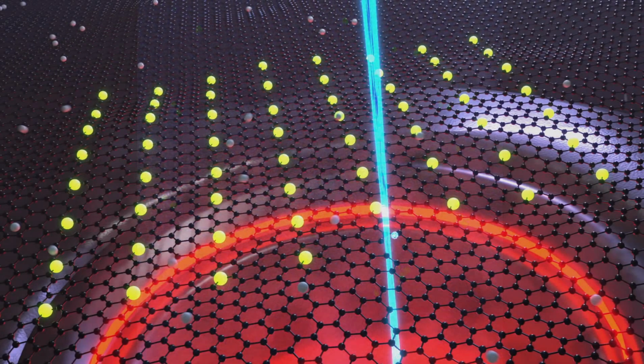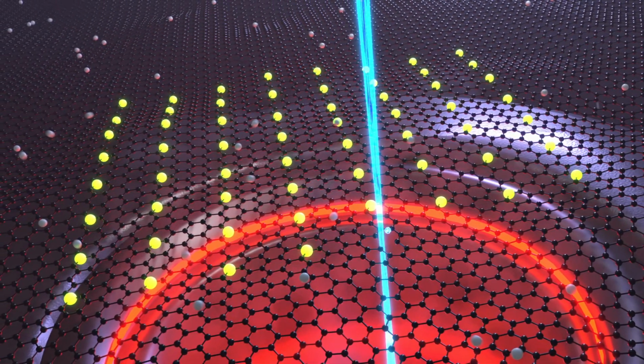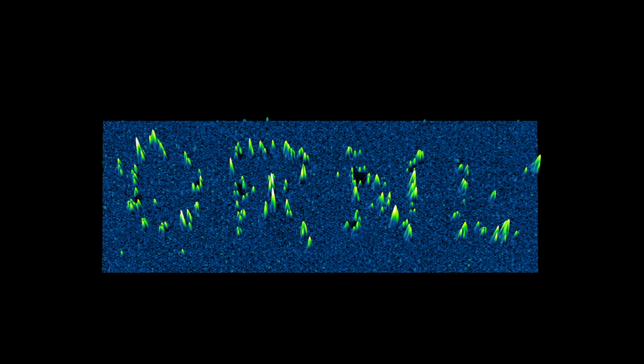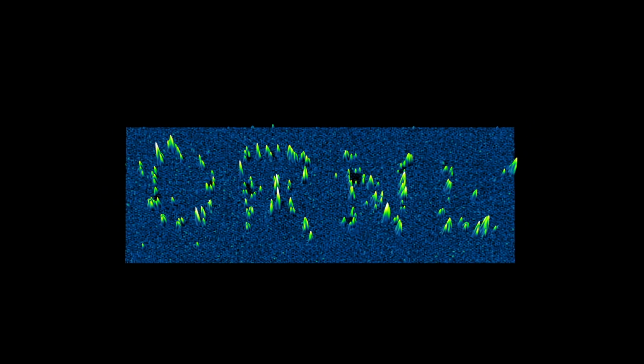These results show how an atomic scale patterning procedure can be established using a scanning transmission electron microscope as a manipulation platform. In particular, we found environmental parameters that facilitated a bottom-up chemical reaction to a top-down alteration of the substrate. This combined bottom-up and top-down approach allowed the patterning of copper atoms anywhere we desired.